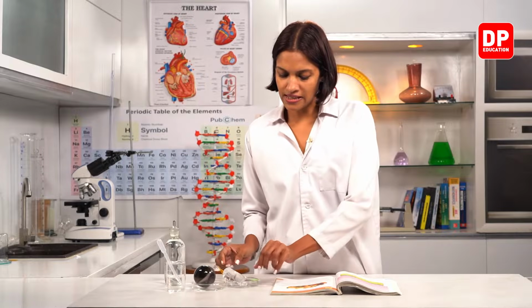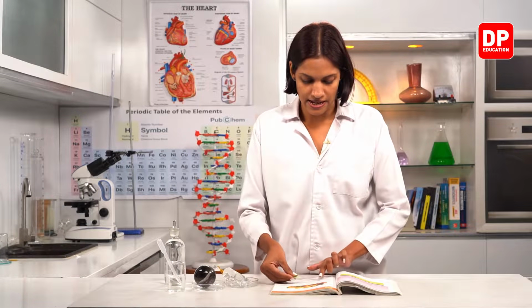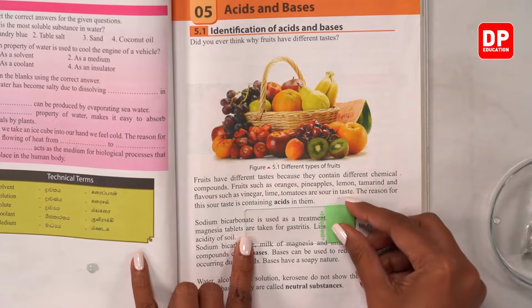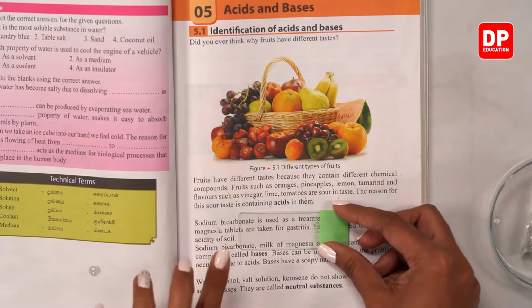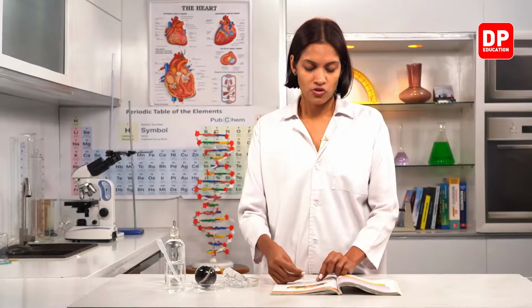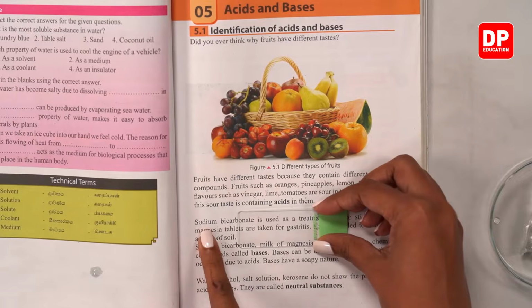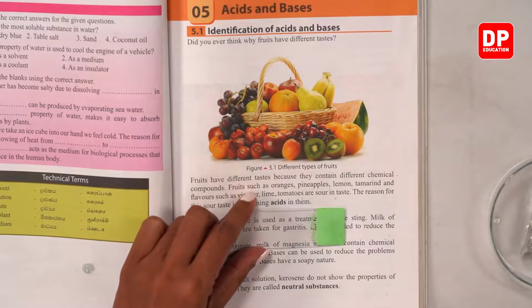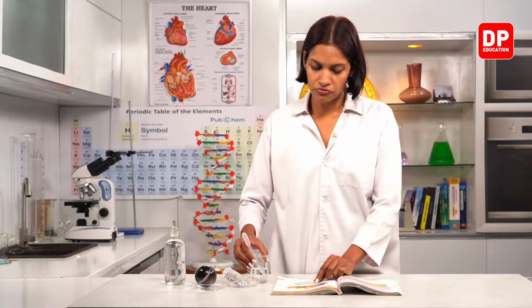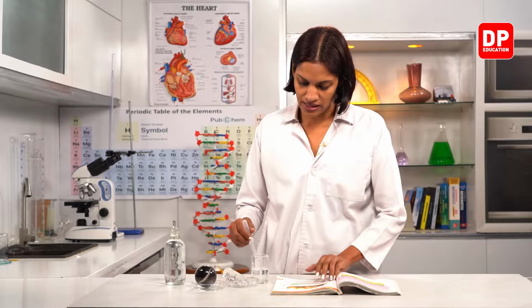Now I will take this glass slide and I'm going to place this glass slide like this. Is there any difference, children? Can you see any difference here? There's no difference here, right? So the size of the letter is the same here. You all can see it's as same as this side. Now, what I'm going to do is I'm going to take a drop of water and place it on this glass slide, and then we will observe again.